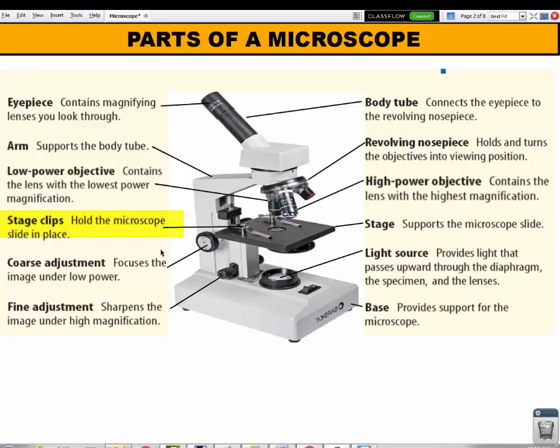We have two adjustment knobs that you should know about. We have the coarse adjustment knob, which is the bigger knob, and this is used to raise the stage or lower it, and this is what we use to focus on low power. So when we're under the red, the 40 power, or the yellow, the 100 power lenses, we use this to help focus.